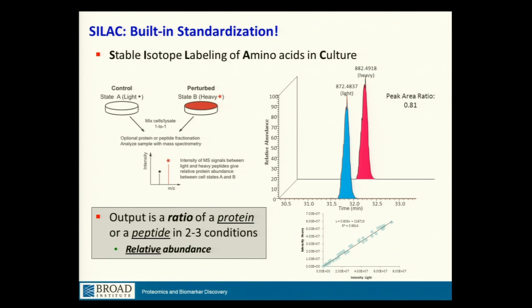All right, so once we do that, we can do our LCMS experiment. We can find differences that are due to heavy and light amino acids in each spectra. We can make extracted ion chromatograms now of heavy and light versions of peptides that we see together, and they're coming out at exactly the same time in the LC dimension, the retention time dimension of an LCMS experiment.